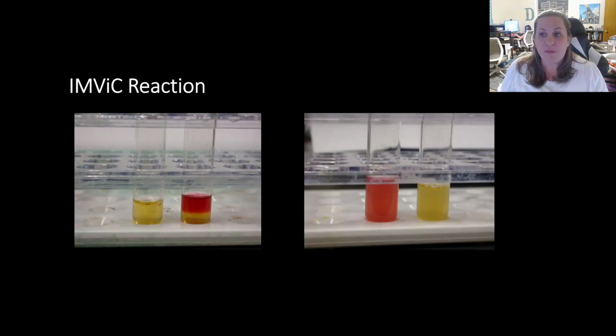So if we take a look here, you can see I have two sets. See how they halved the fluid in each. We ran the test, and on this first side, we see that it is MR negative because it is yellow in color. But since it is red on the top of the VP test, this one is VP positive. On the other hand, if you look at the other type of bacteria, this one would be MR positive because it's red, but the VP is negative. All right, and so you're going to do both of these tests, looking at the MR for methyl red and the VP, seeing which ones are positive or negative. But remember, the red color indicates that it is positive.